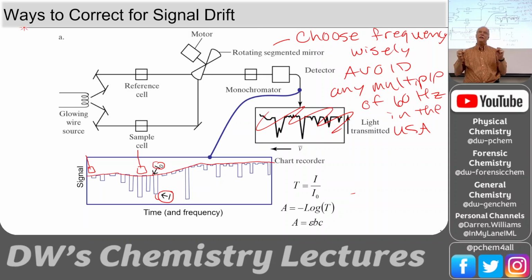What's going on at 60 hertz in the United States? Not radio. That's a good question. Our FM bands are in the megahertz. Okay, so you'd want to avoid those too. You wouldn't want to run it. In Huntsville, we don't have a lot of choices. What's our radio station? 100.7 KSAM? I think it's one. Don't quote me, but it's around 100 megahertz. So you would want to avoid that too.